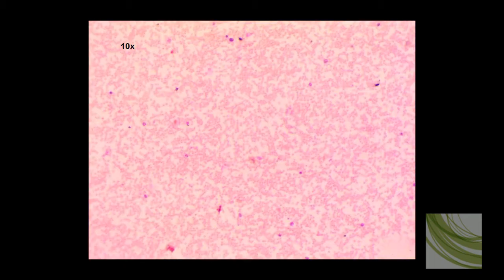When we magnify using the 10X objective we can now start to see some of the individual erythrocytes and leukocytes mixed through here. Although we're still having trouble seeing the parasites, the trypanosomes.